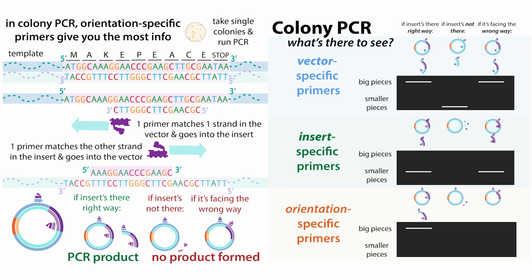The problem with this is that it's still not giving you the entire plasmid, and you could have mutations elsewhere that you don't realize, because you are only seeing that the mutation you want is present. But this can help you decide which colonies are worth sending for sequencing. But then I would still send the entire plasmid for sequencing to get that better information.